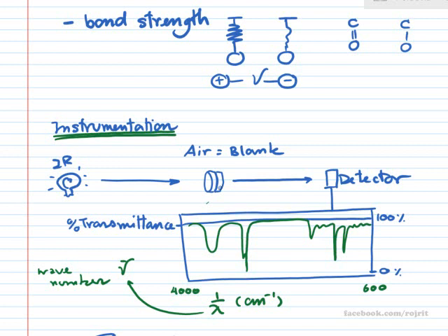So we normally use potassium bromide crystal, grow it into a very huge crystal structure and cut it into glass-like pieces. Actually, it's a KBr disc. From the KBr disc, you just drop your sample in between.